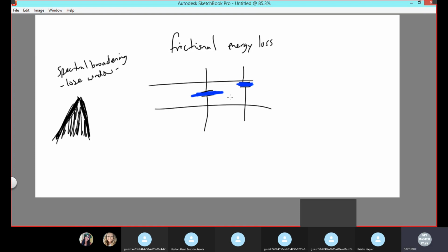You're not going to walk very quickly. You're going to get tired out. You're going to tire out very quickly as well. Okay, so that's frictional loss. So that is why we put our sample gate in the center, because in the center, we're very far away from the walls. It's kind of like a freeway. The center is the freeway. It's the center lane in the freeway that's supposed to go fast. Like the left lane can turn to the left, the right lane can turn to the right, but the center one just goes straight. So it's supposed to be fast, right?